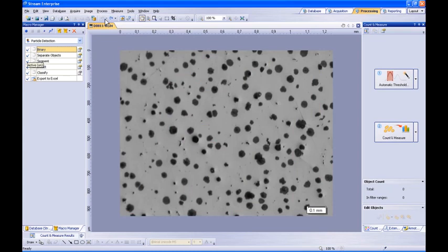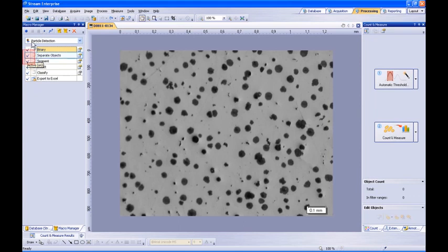As your application requirements may change, the macro can be easily modified. For example, let's say that you no longer wish to have objects separated in the macro. Simply uncheck the active box for that particular step. Next time the macro is run, that step will be skipped.